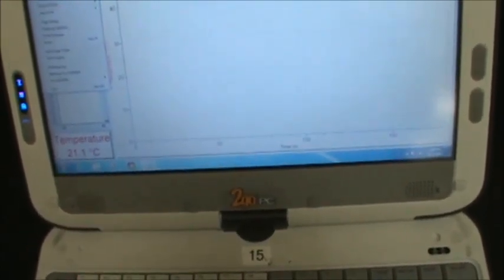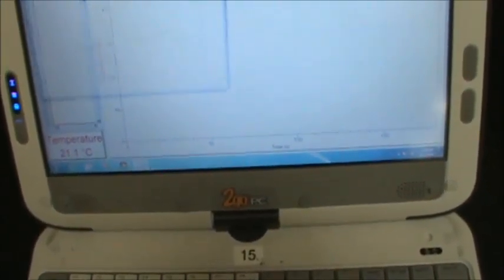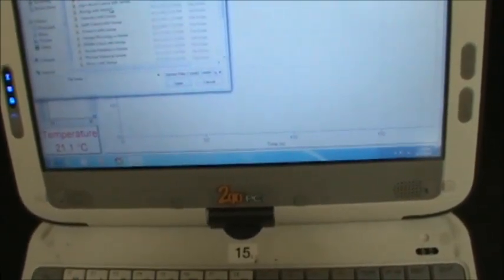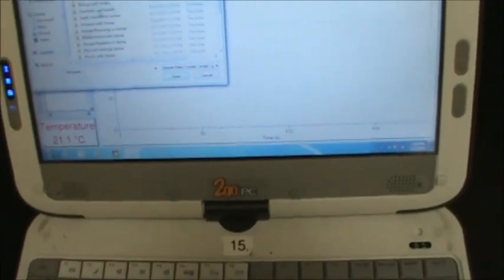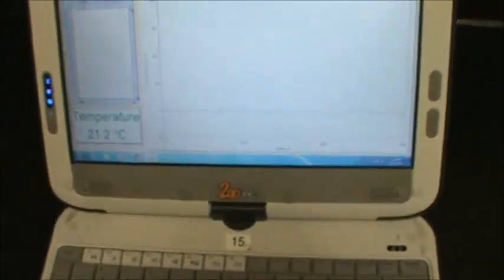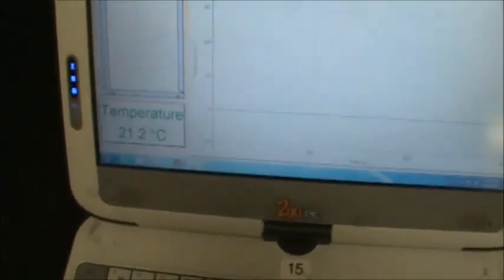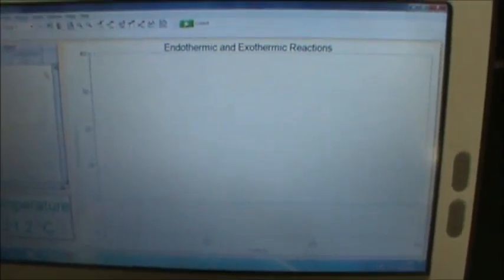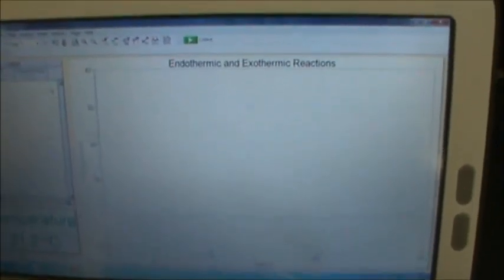The next thing is to open up the file. I click File then Open, and it says I'm going to find a file called Endothermic Exothermic under the Chemistry folder for Vernier — it's the very first file. It opens it up, and you still have a temperature reading, a title, and it's all set. Now you're all ready to record.